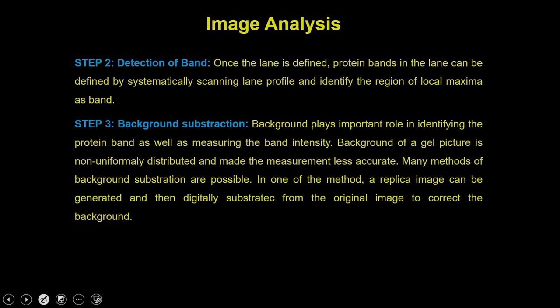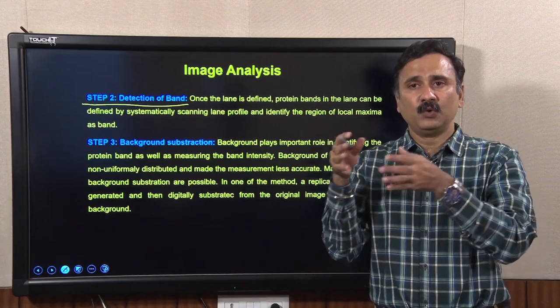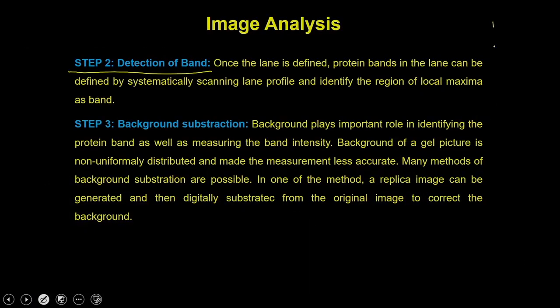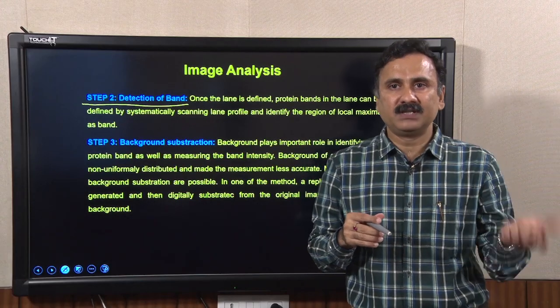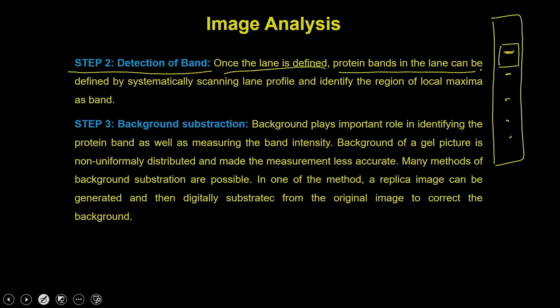In step 2, you have to do the bands. For the band in which you are interested, you need to know the position of that particular band as well as the intensity of the band, which means within the lane you can have multiple bands, and within this lane you can also select the band which you are interested to measure or analyze. Once the lane is defined, your protein band in the lane can be defined by systematically scanning the lane profile and identifying the region of local maxima as a band.